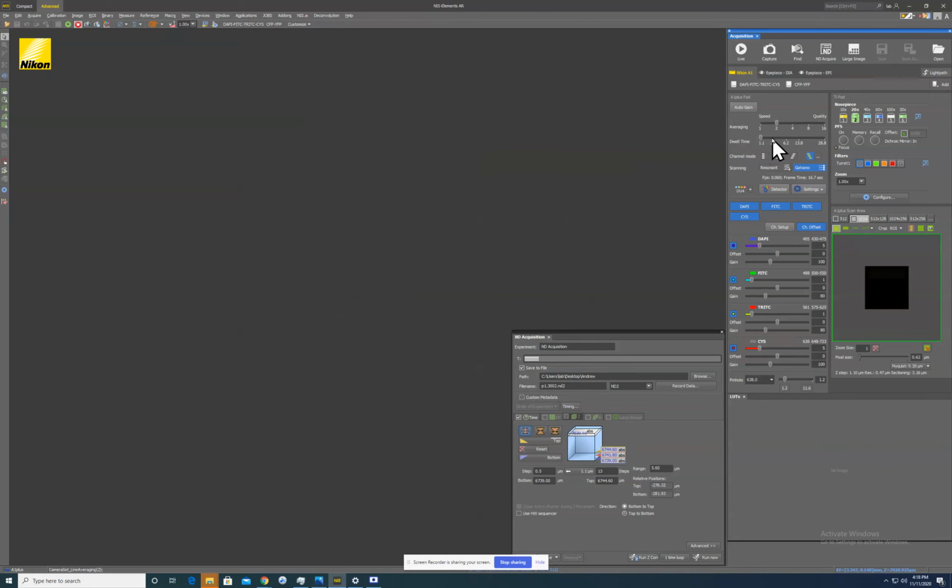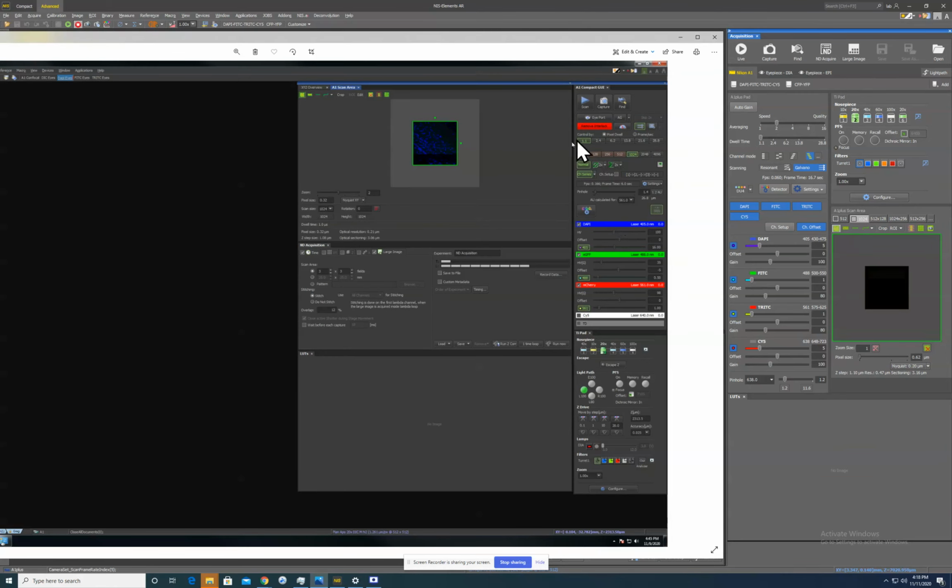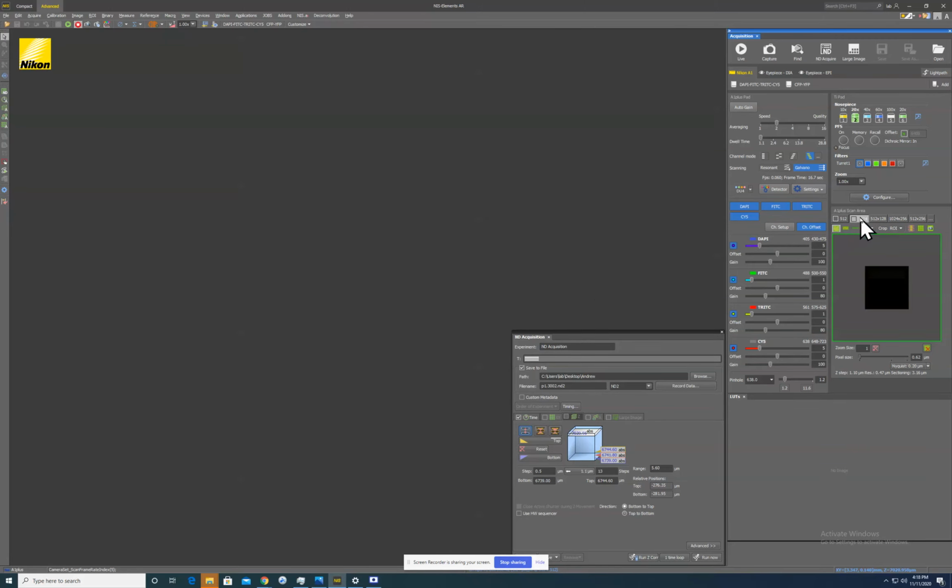And instead of being a button, it's now a slider. 1.1 is the lowest one. And right below that, you have your image size. 1024 by 1024 is typical publishing standard. That is now over here. So 1024 by 1024 is this one right here.